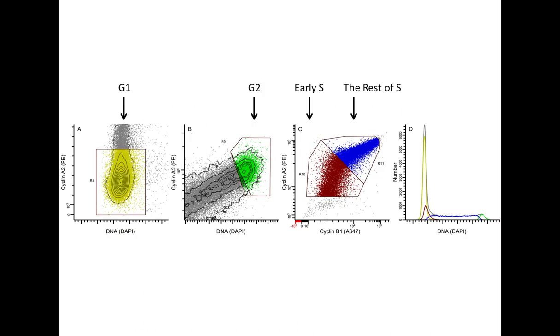The next steps are to isolate G1 proper, that is minus early G1. Both G1 and G2 can be segmented using cyclin A2 versus DNA plots with M cells removed by Boolean logic. The remaining cells are in S. The critical G1S and G2 boundaries can be checked by comparing the G1, S, and G2 phase fractions of the DNA distribution determined by Gaussian modeling of DNA content with programs such as ModFit to the frequencies of cells determined by color coding logic.